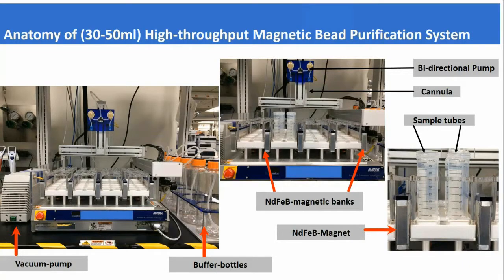This slide now shows you the critical parts of the magnetic system here, and I probably will not spend too much time on this because everything is very much self-explanatory. The mechanism, just briefly, is that these magnets you see, shown by the arrows, are able to move backwards and forward. When they move backwards, they release the magnetic field, so the beads are now free to separate from the walls of the vessel, and they are able to mix with the buffer. After that is done, the magnets move forward, and the cannulas you see here will go inside the tubes of the vessels, and the tubes will go inside the falcon tubes and withdraw all the liquid out of there. That's how you do the purification. It's really dispense and aspirate, and dispense and aspirate. That's the cycle. During that time, the magnets are moving backwards or forward.